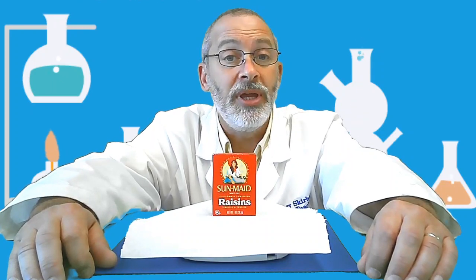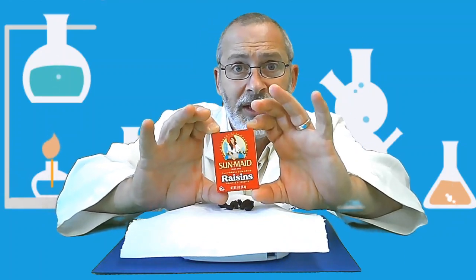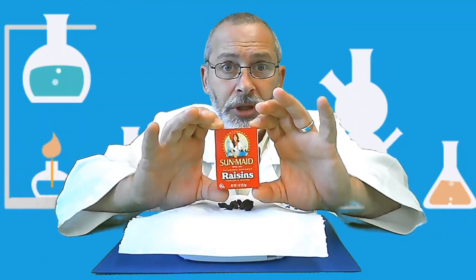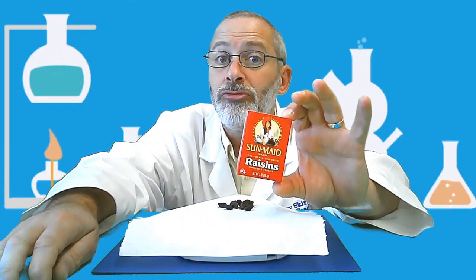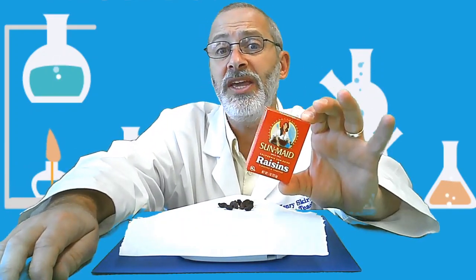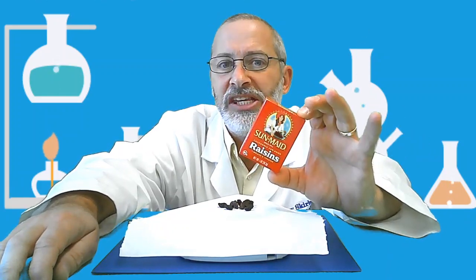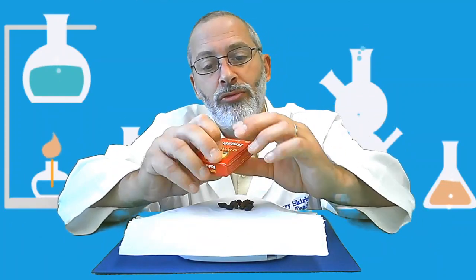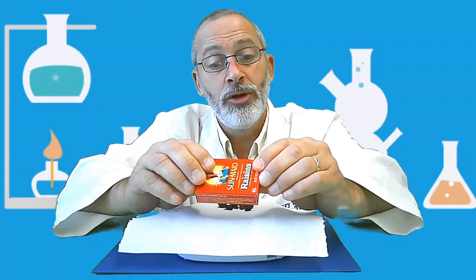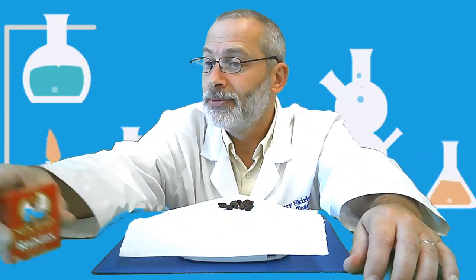First, we're going to begin with, I heard it through the grapevine. We're going to start with some California raisins, one of my favorite snacks of all time, packed with lots of yummy, sweet goodness and fiber, which helps keep you regular as well. So the only ingredients here are raisins, sun-dried grapes.